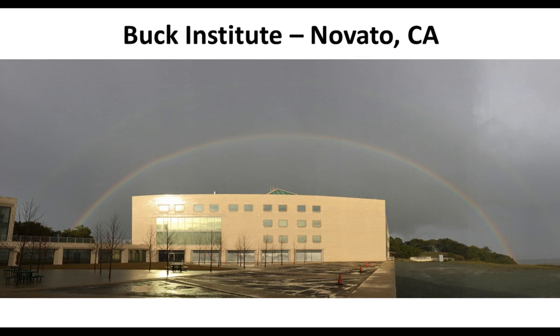I'll just interject here as well. One of the cool things about doing the PTM scan in a serum or plasma sample is what we've found and published on, that it kind of obviates the need for depletion kits or depletion columns for that serum. So you can directly take that serum. A problem with serum is the abundant proteins, things like albumin and the other 20 abundant proteins. You can take that sample now and just do, say, an acetylation enrichment or a methylarginine enrichment. Now you don't have to deplete before, and you're getting a real good look at even lower abundance proteins in that serum by doing the enrichment.